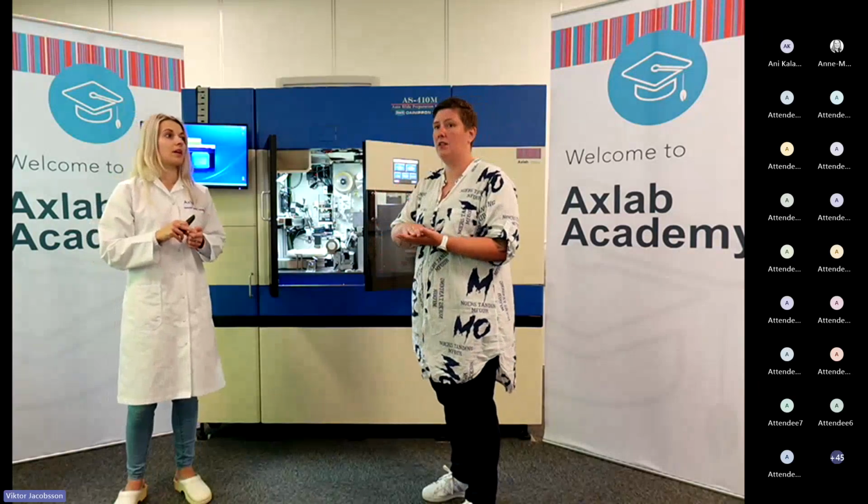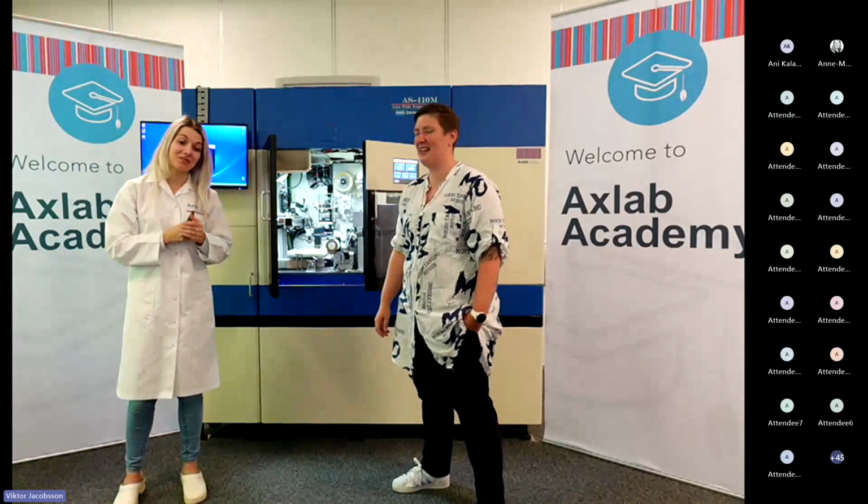I would think it's at 99. Of the, okay, 99 levels. But I have never encountered a customer that wanted 99 levels. That's a lot of levels. You have to have a high block, and you have to have a really high block, and the micrometer in between the levels has to be very small. Yeah, but you can do it.